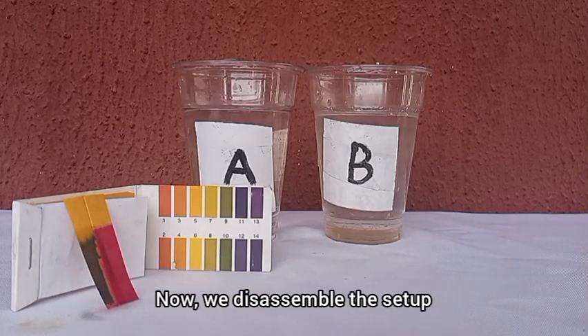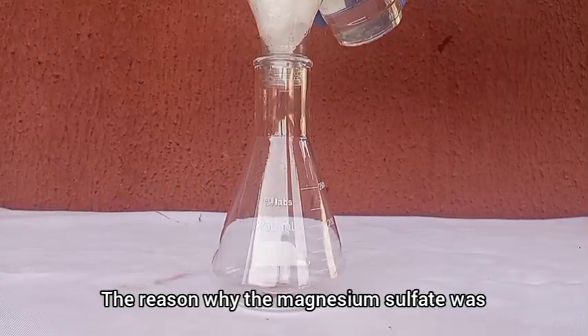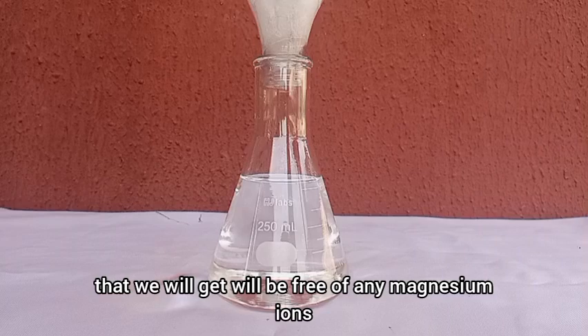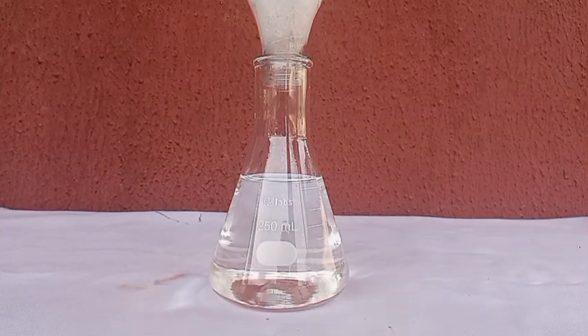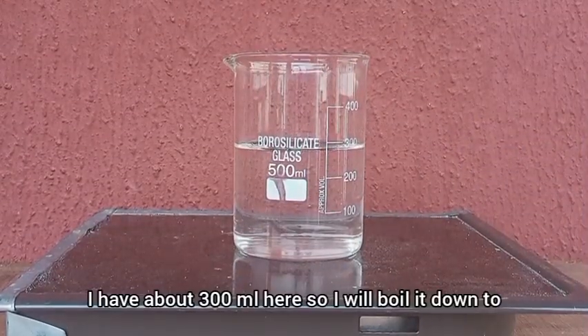We disassemble the setup and filter our solution A. The reason why the magnesium sulfate was dissolved in only one vessel was so that the resulting sulfuric acid solution would be free of any magnesium ions. Once the filtration is complete, we boil our solution to concentrate the acid — I have about 300 mL here, so I will boil it down to about 100 mL.